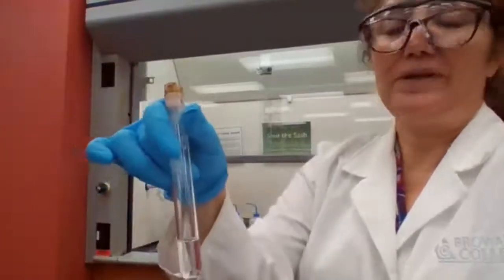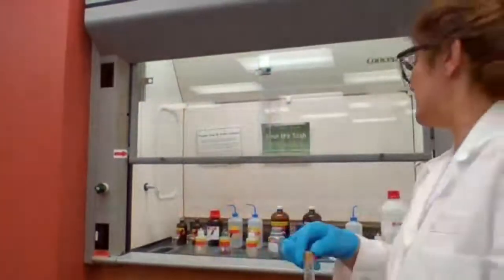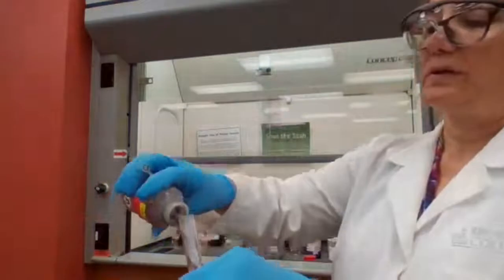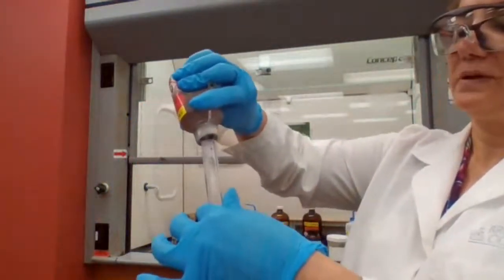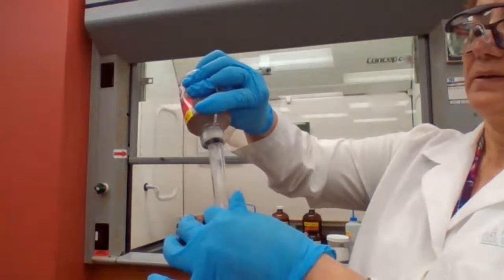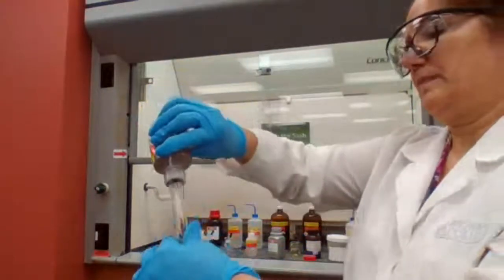Because I had my sample already, I dissolved it in ethanol. Now I need to add the silver nitrate. So 2 milliliters is about 40 drops. So I'm adding about 40 drops of the silver nitrate. Okay.